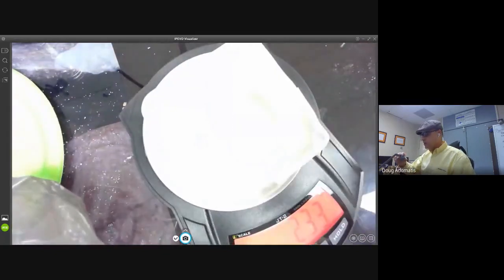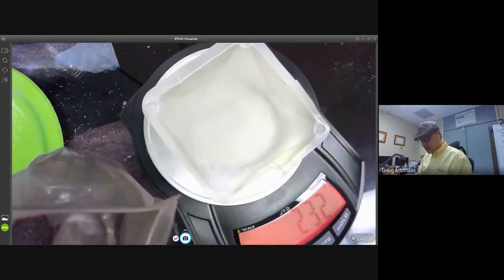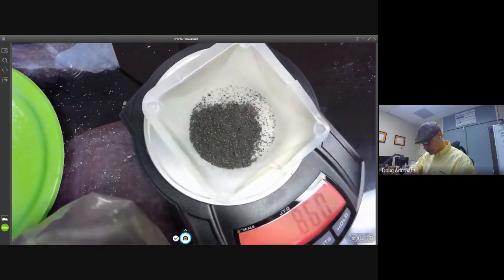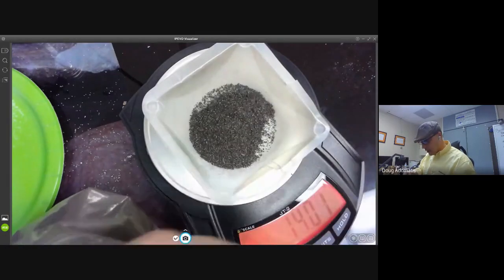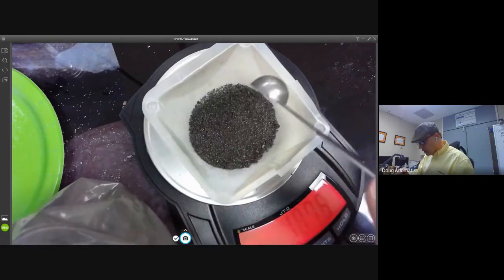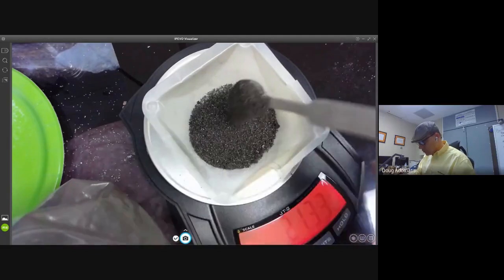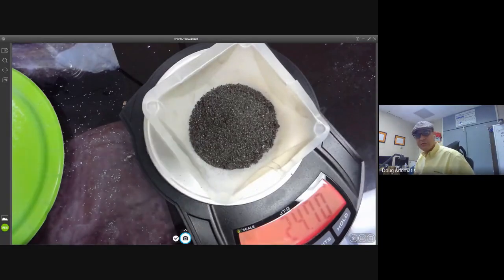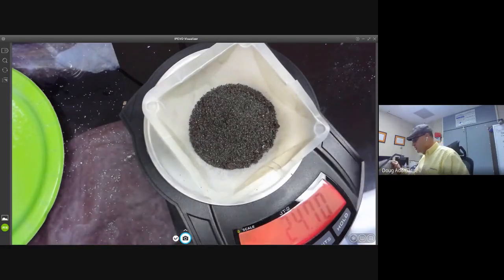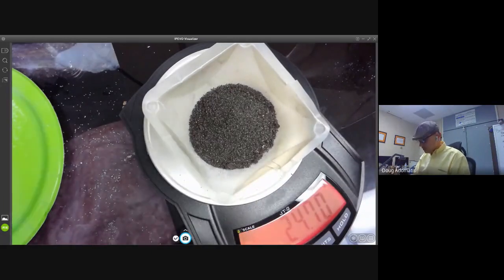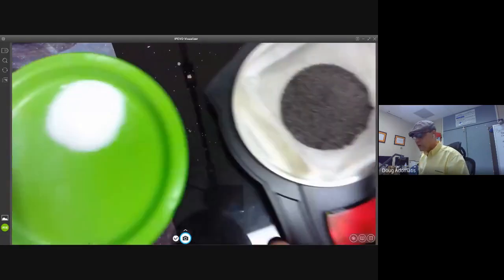The iron filings are not magnetic themselves, but they are attracted to a magnet — that's one of the physical properties of iron. I'm going to take a measured amount. Carlos, write this down: 24.7 grams of iron. By the way, is iron an element or a compound? Don't everybody shout at once.